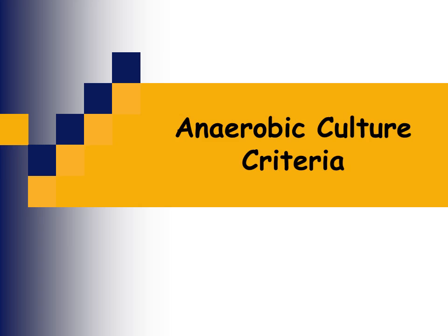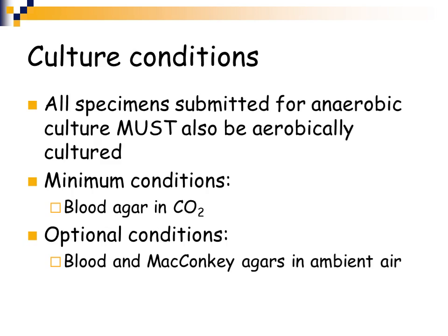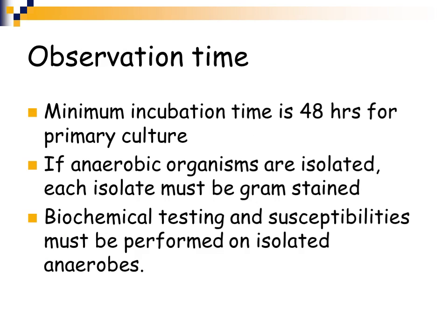Now we're going to talk about the anaerobic culture criteria. So all specimens that are submitted for anaerobic culture must also be aerobically cultured. I've already said that a couple of times. Now the minimum conditions that you could use are inoculating your specimen onto 5% sheep blood agar and incubating it in the CO2 incubator. You can also inoculate blood and MacConkey agars and incubate those in an ambient air incubator, in addition to inoculating your anaerobic media and putting your media in anaerobic conditions.